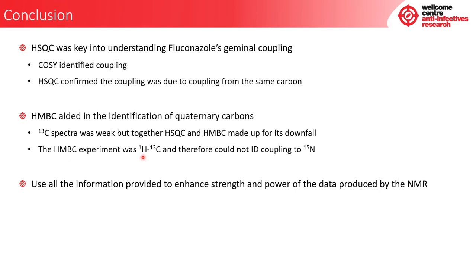Because it was measuring a proton-carbon coupling, it could not detect the coupling to nitrogen, but also note that HMBC can be run with a proton to nitrogen coupling. So you can see here that all of the information, the 1D, the COSY, the HSQC and the HMBC, all enhance the power to be able to understand the spectra and the structure of fluconazole.